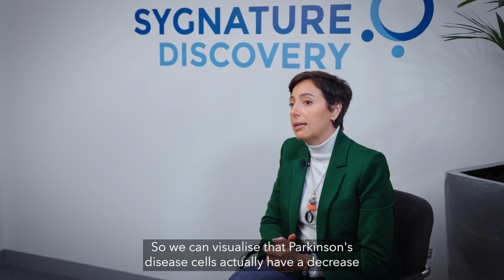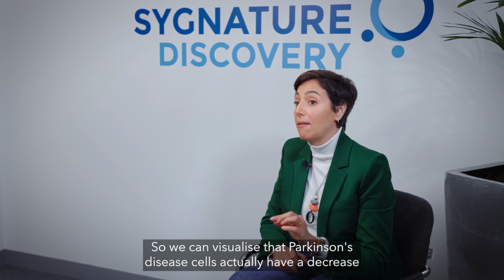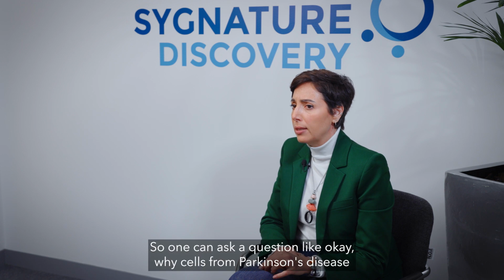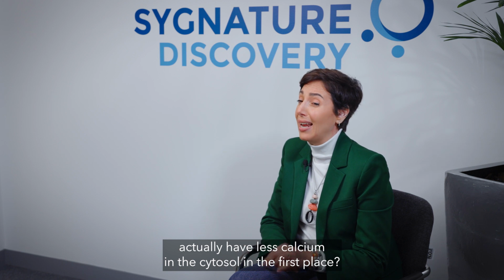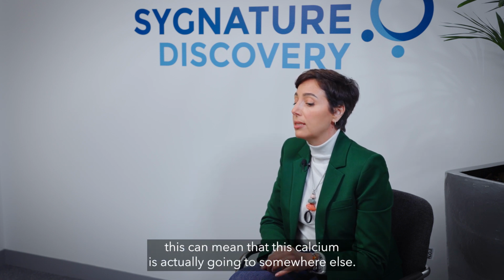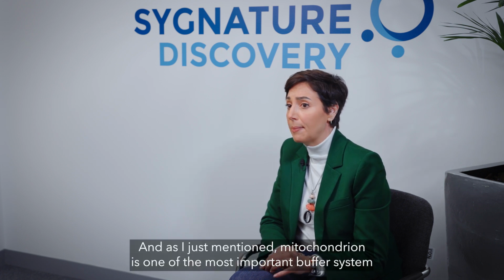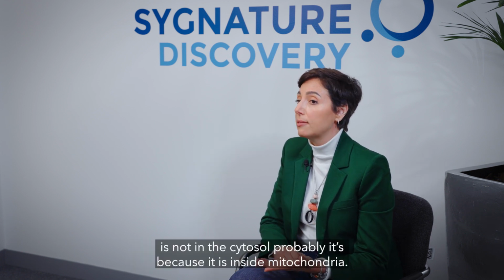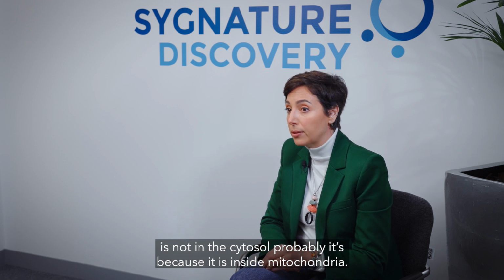We can visualize that Parkinson's disease cells have a decrease in the basal fluorescence of Fluo-3, meaning a decrease of cytosolic calcium. So one can ask, why do cells from Parkinson's disease have less calcium in the cytosol in the first place? If we have a decrease in calcium in the cytosol, this can mean that this calcium is going somewhere else. As I just mentioned, mitochondria is one of the most important buffer systems, so if the calcium is not in the cytosol, probably it's because it's inside mitochondria.